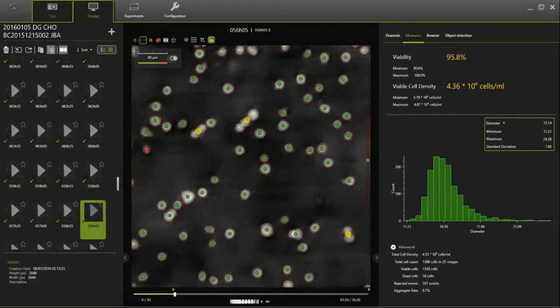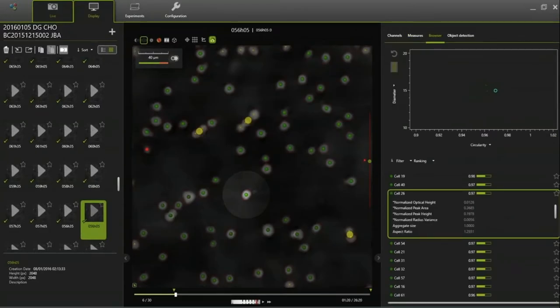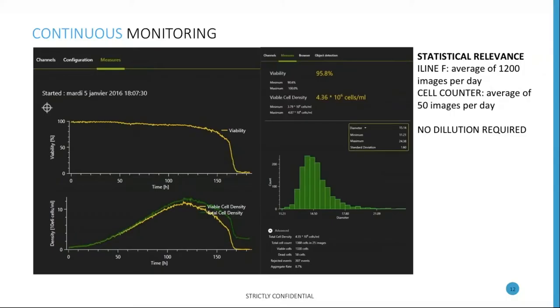When aggregates are small enough you even get a count of the number of cells within them. On the right side of the screen you see the results for viable cell density, total cell density, and viability, plus a distribution graph — in this case of diameter. You can analyze all individual parameters, even at the single cell level. You can export all data as a PDF report or as a CSV file containing all parameters across all data points for all cells. We take around 1,200 images per day, which is a huge difference compared with standard cell counters.